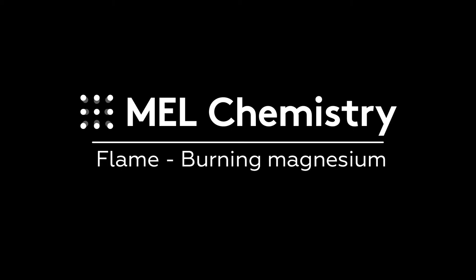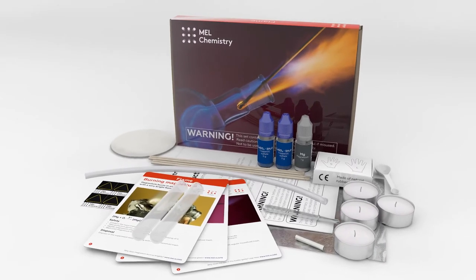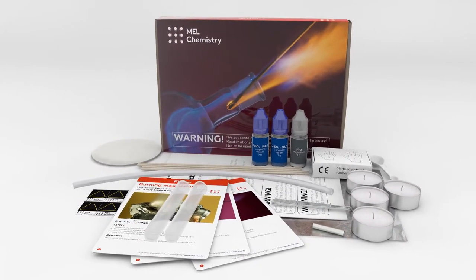Welcome to the wonderful world of chemistry. Today, with the help of the flame experiment set by MEL Chemistry, we will watch magnesium burning.